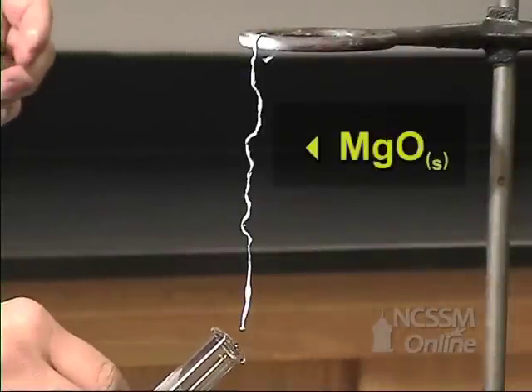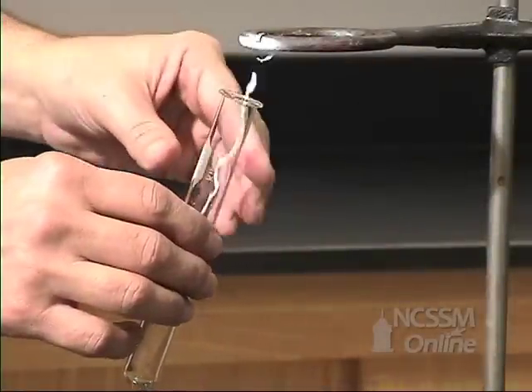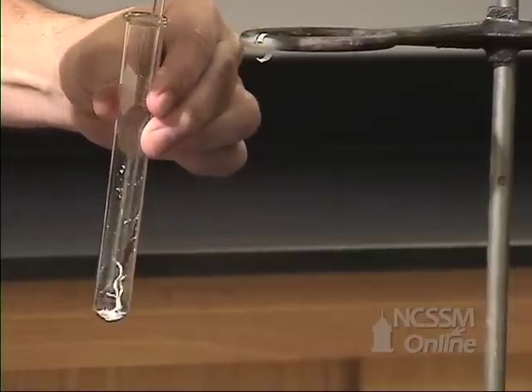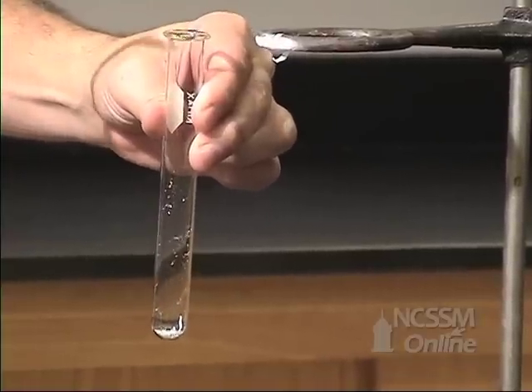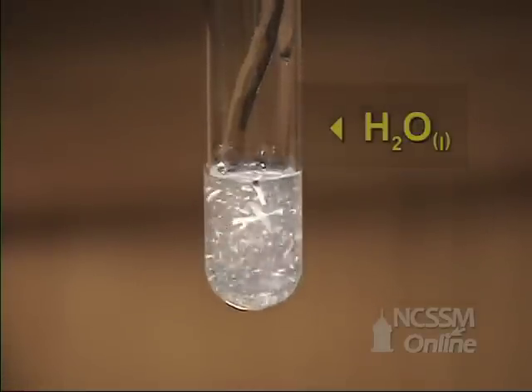If we take the magnesium oxide that we produced from the synthesis reaction, we notice that it's a very brittle white solid. If we add water to the solid and stir it, we see that the compound is not very water soluble.